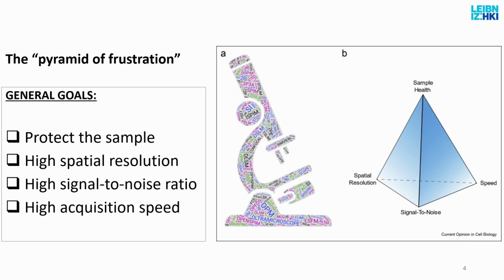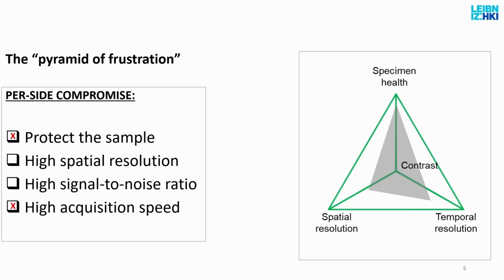And last but not least, you cannot set up an experiment which lasts 24 hours like a microscope. So you need a special place where you are allowed to do that. So you also want to limit how long the experiment actually takes. And you may want to go home at some point too. So for this one, you have to choose your priorities.